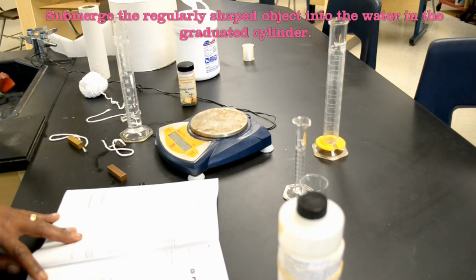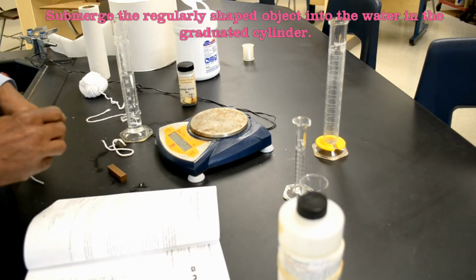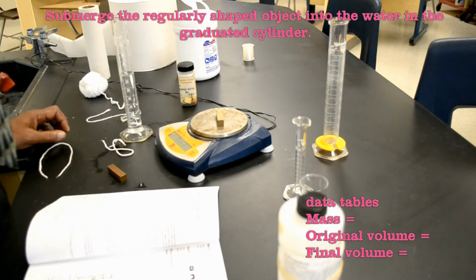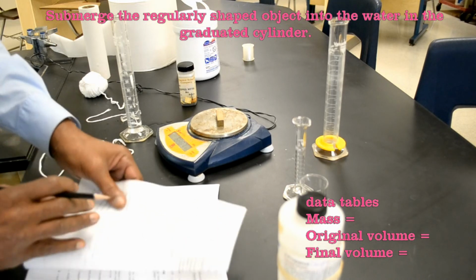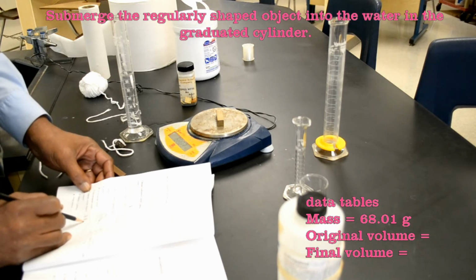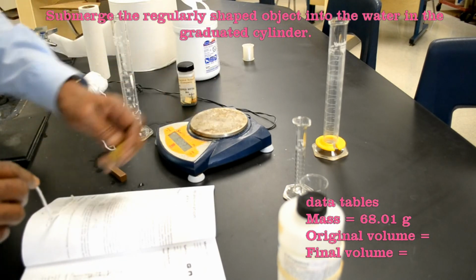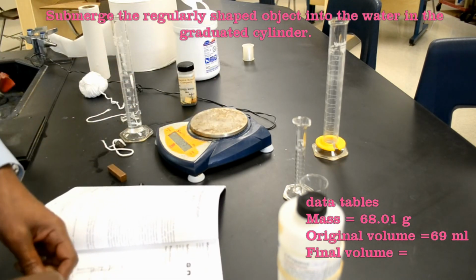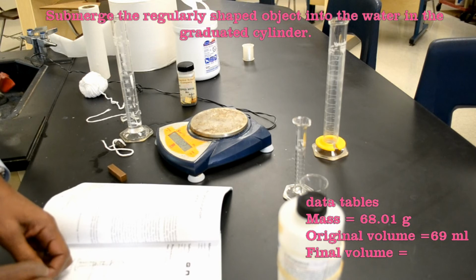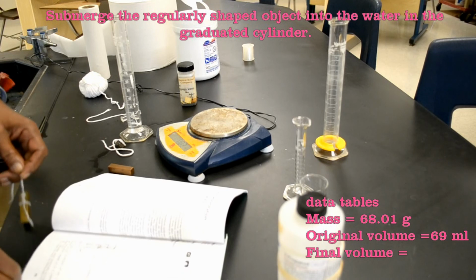Now I'm going to do my regularly shaped object. I'm going to use the same regularly shaped object that I used before, but this time I'm going to mass it. The mass is 68.01. The original water level is still 69 mLs, so I'm going to record that.